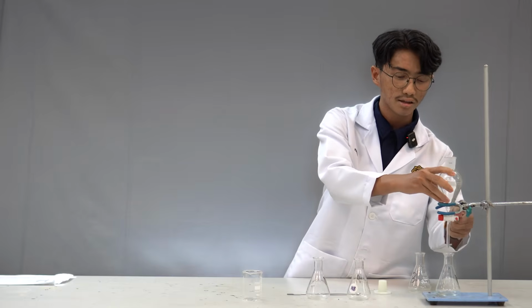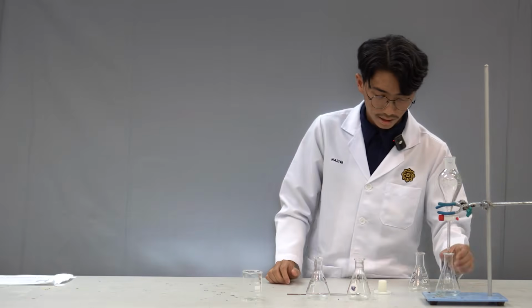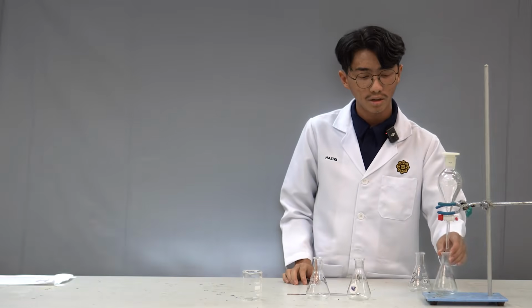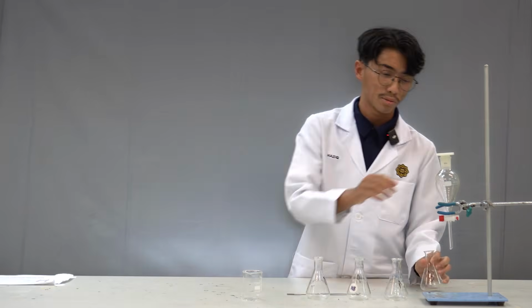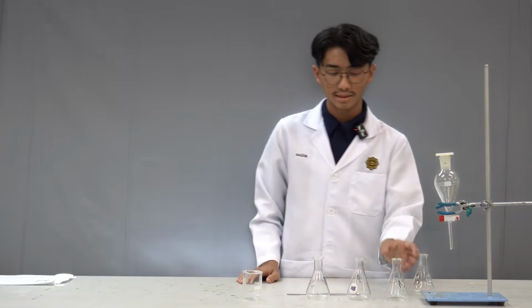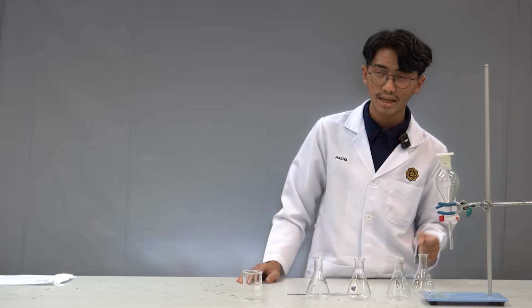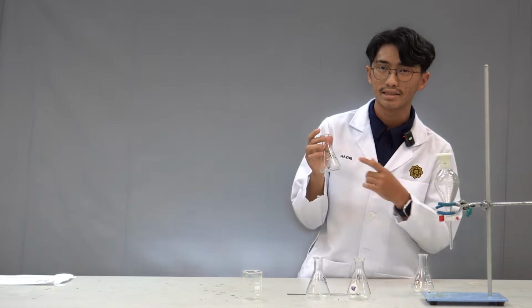After all the mixture of neutral and base is out from the separatory funnel, what we have in the separatory funnel is only base. So we put what is left into the base flask, and then we can repeat the step again to get a little base that's still in the mixture flask.